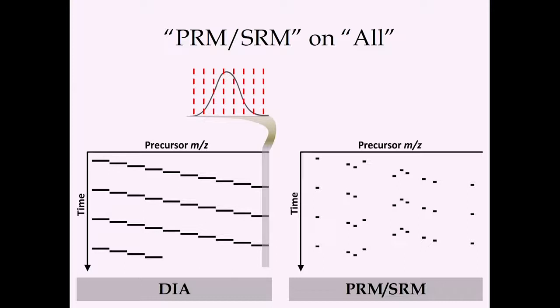I do really want to emphasize this importance of chromatograms. We're so used to thinking about things as spectra that I really do believe that one of the key things about data-independent acquisition is the fact it's a chromatographic method, that we look at our data as chromatograms often, and the signals that we represent are some sort of integrated signal across time. That's the reason why we got drawn to it, because it's really hard to do quantitative analysis off of individual spectra, and it's much easier to do quantitative analysis off of chromatograms.